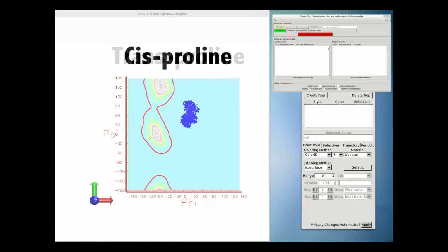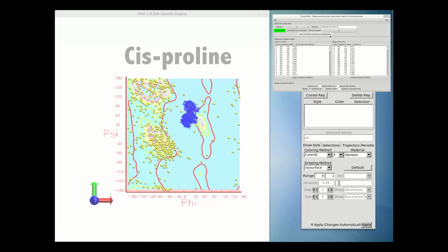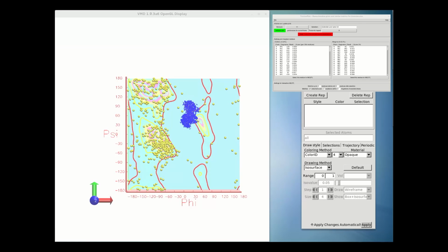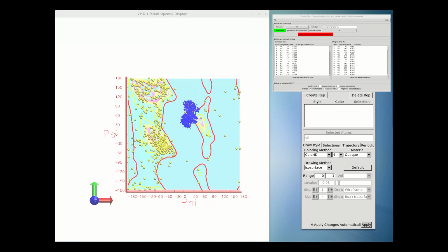as much as possible. The simulation for this is actually already initialized and waiting, so all I have to do is click Go. We'll just keep watching this in Ramachandran space for a while as it first runs a 100-step energy minimization, then rattles around at 100 Kelvin. We see that most of the outliers clear up more or less immediately, leaving us with just a few dozen more serious cases to deal with.